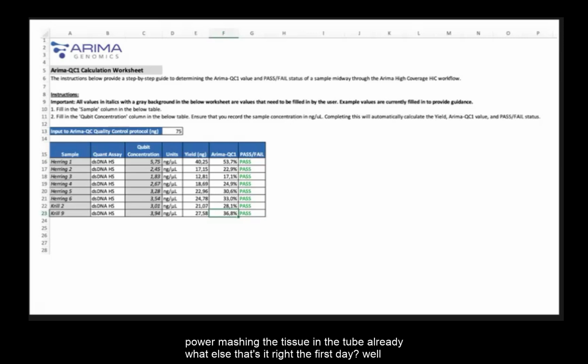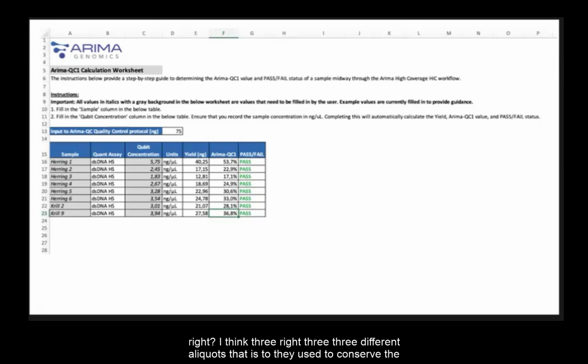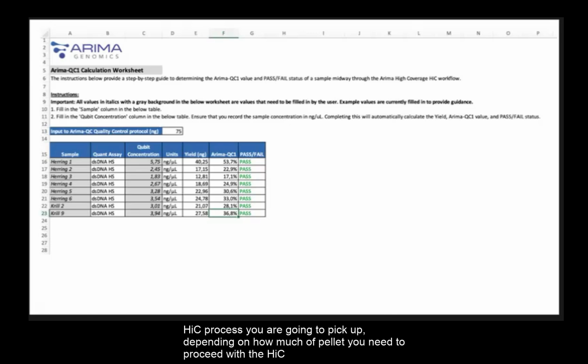That's the first day. After we have everything, we have to collect all the samples, and the standard input group did several aliquots of 20% of material, 30%. I think 3, right? Three different aliquots. They used those to conserve the different samples to use again if we need them, or when we start the HiC process, you pick depending on how much pellet you need to proceed with the HiC.